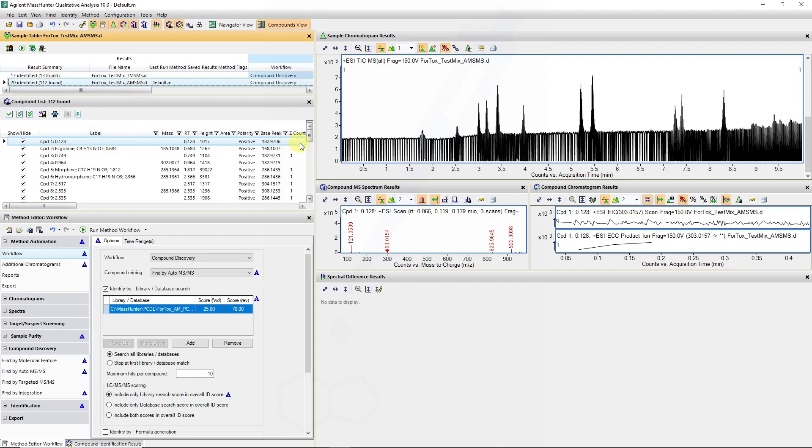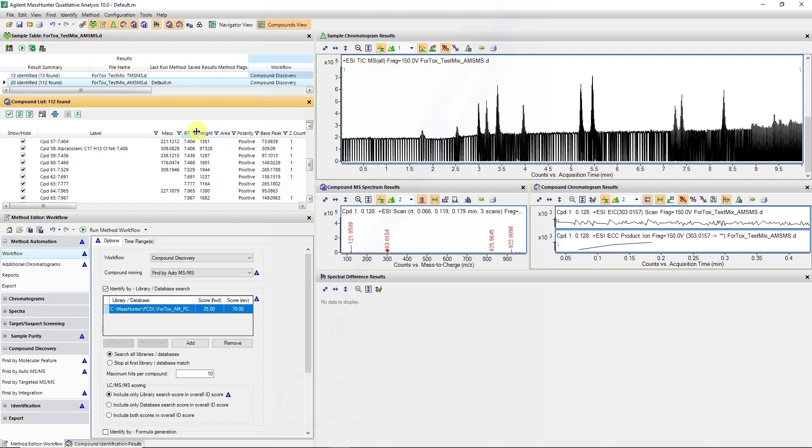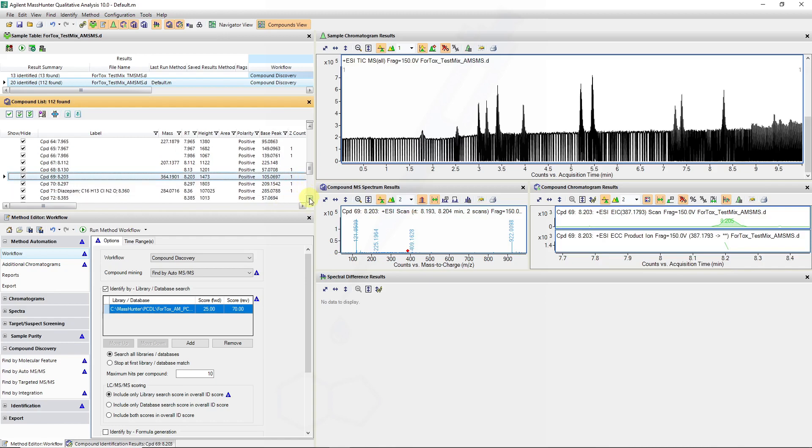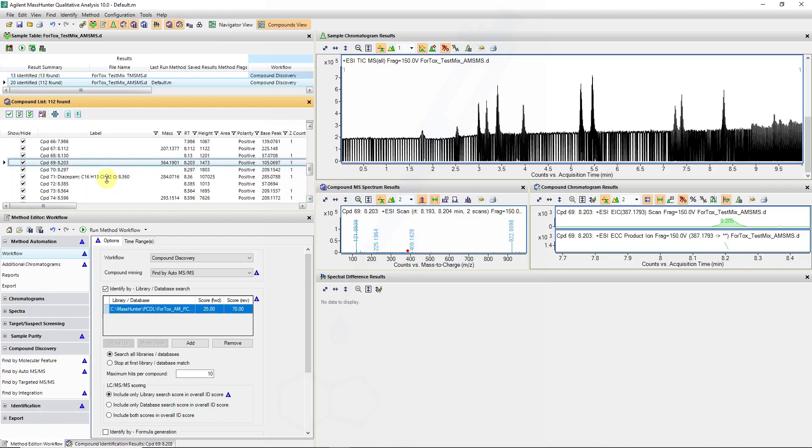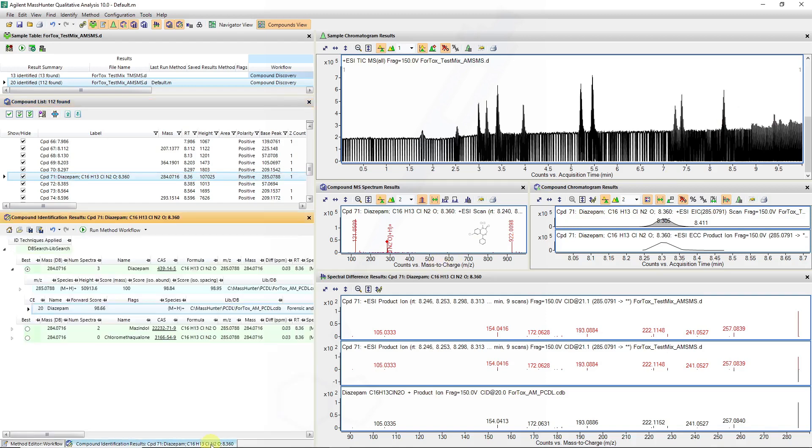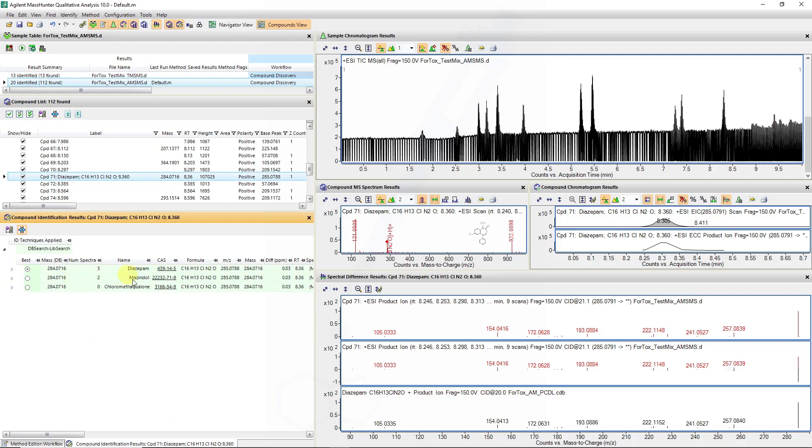We can verify some of these results again if we go to our peak at 8.3 minutes. We can see diazepam was correctly identified in our auto-MS-MS data file with very similar results to what we saw for targeted MS-MS.